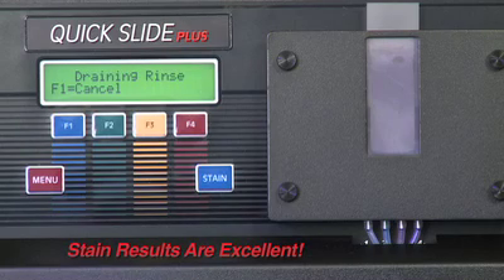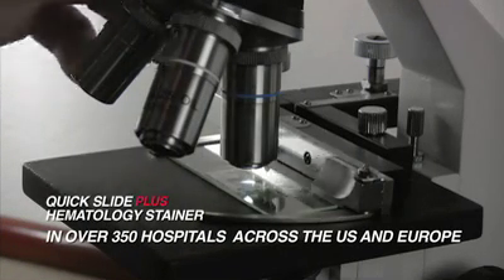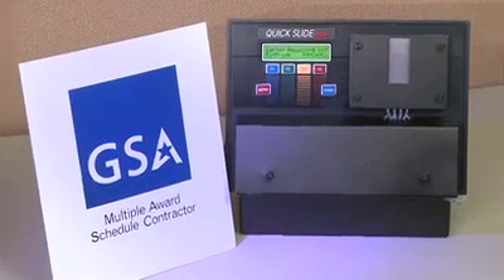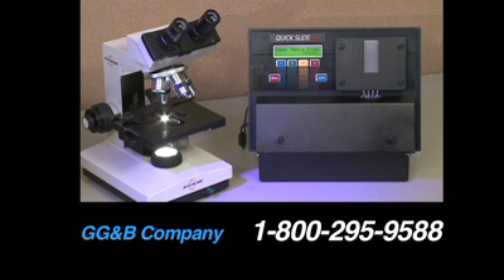Stain results are excellent with no particulate or precipitant. Quick Slide Plus units are in over 350 hospitals across the U.S. and Europe. GG&B is a woman-owned small business GSA contract holder and provides free tech support Monday through Friday, 9 to 5. For the very best in low-volume staining, consider the Quick Slide Plus Hematology Stainer. For more information, call the GG&B Company at 1-800-295-9588.